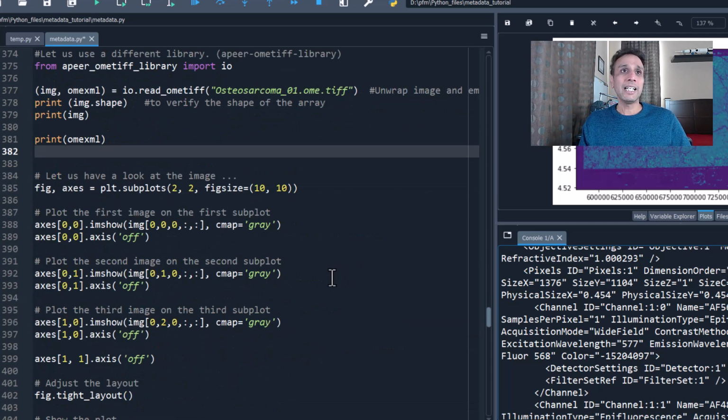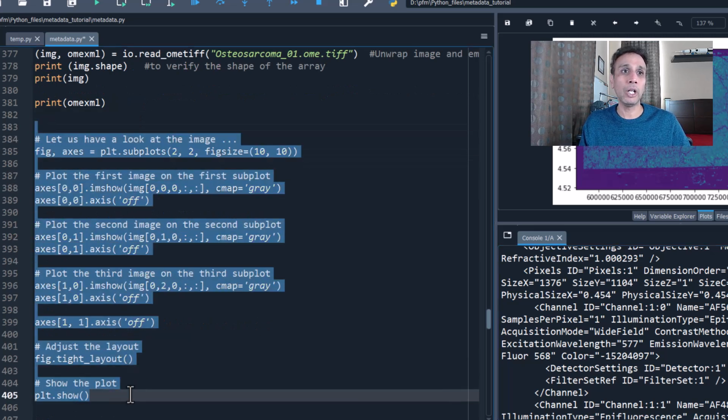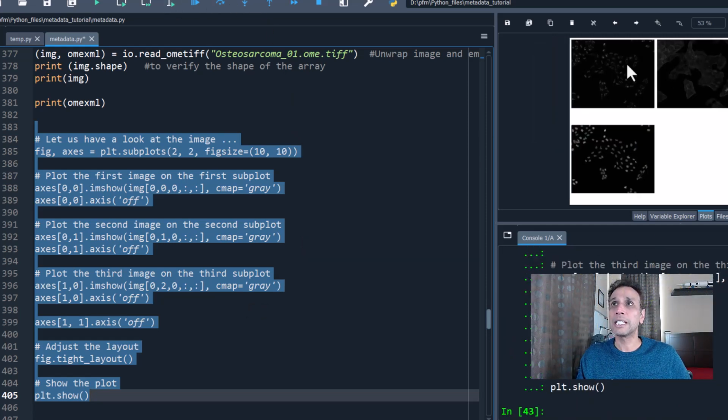And we talked about this image. We may as well have a quick look at this image. Again, this is 3 channels, so I'm printing 3 channels in separate grids up here. So you can see channel number 1, channel number 2, channel number 3. Obviously, a biological tissue image showing you a whole bunch of nuclei here and a whole bunch of cytoplasm. And these, I believe, could be mitochondria, but it's different markers highlighting different organelles within your cells.